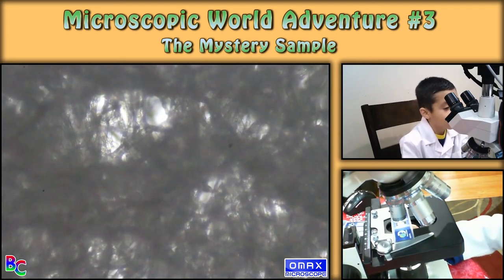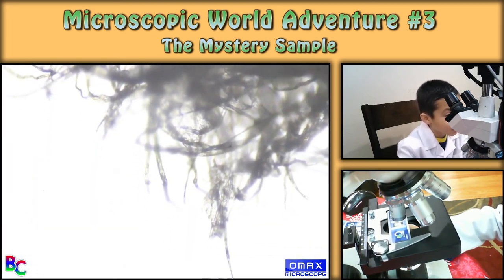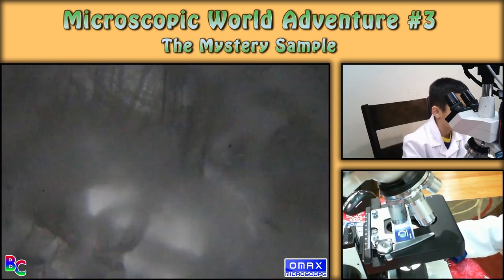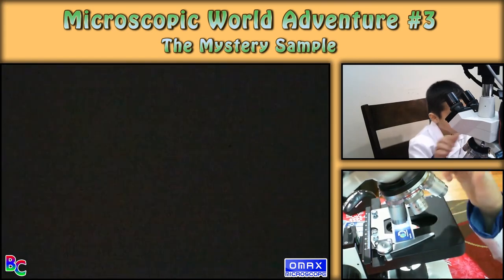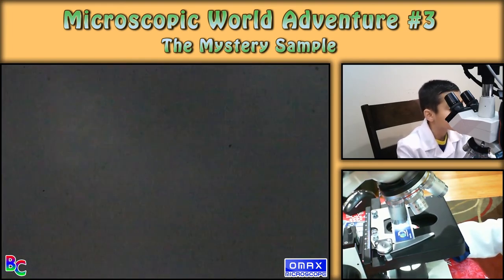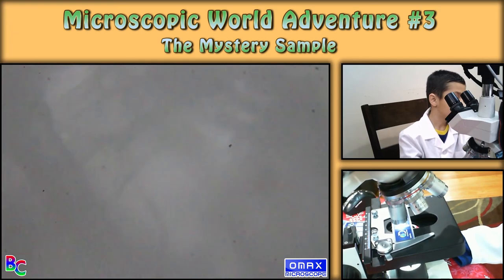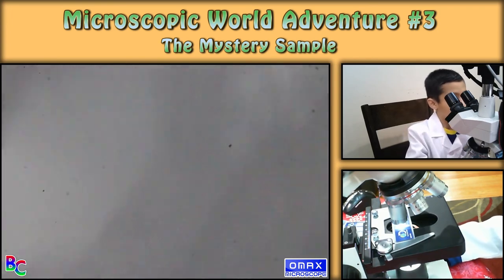There are like little hairs inside a hair — I don't know why. This is gonna be so hard to guess. There are like wire hairs, I don't know why. This is the biggest one possible. It looks like DNA from Spiderman sort of. There you go — you can barely see, but that's the best I could do. So have you guessed yet? The answer was actually tissue paper!